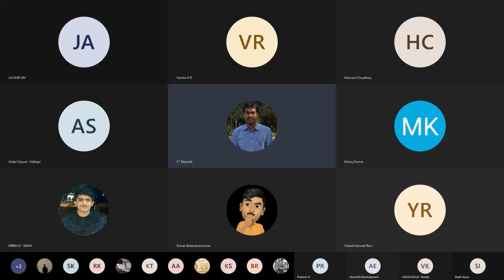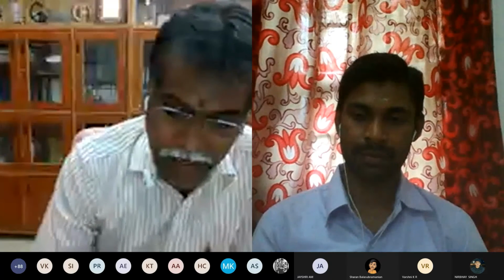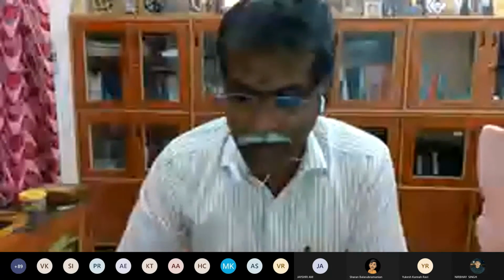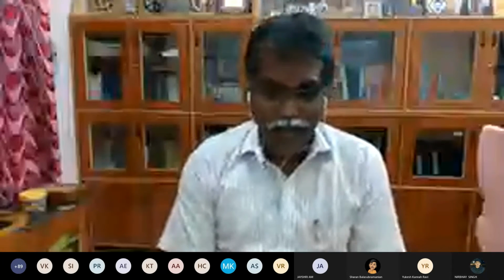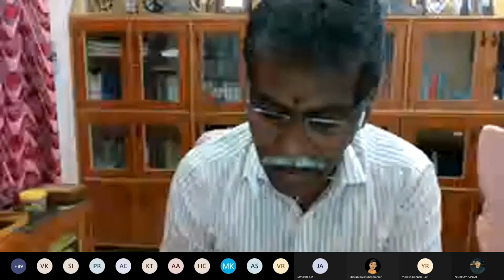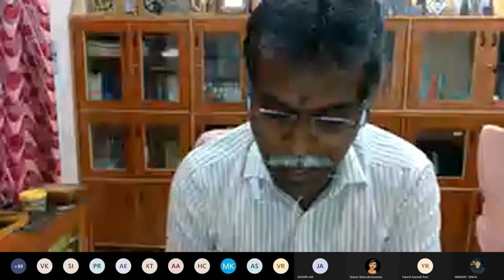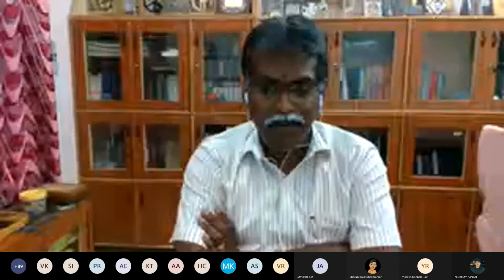Move on to experiment number 2, determination of turbidity. Those who are familiar with physicochemical processes or water treatment, and turbidity, which you would have studied last semester, it is the technical term referring to the cloudiness of a solution, which is imparted by solid particles and which may obstruct the transmittance of light through a water sample. Please make a note on cloudiness or haziness.